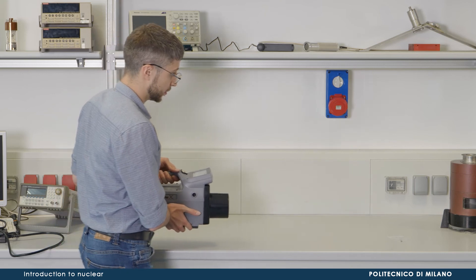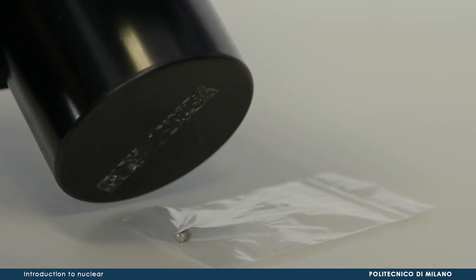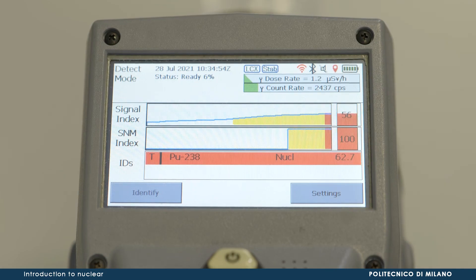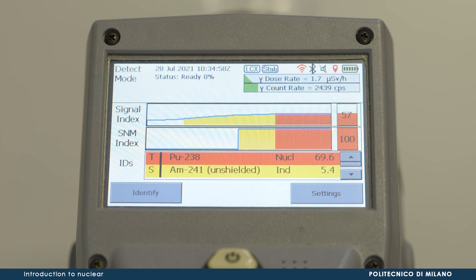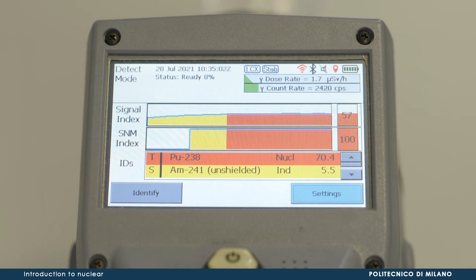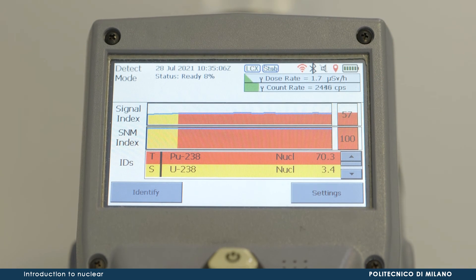By bringing the detector sufficiently close to a radioactive source, the count rate and estimation of the dose rate will be displayed on the detector screen, together with a listing of the radionuclide content of the source. The device can also be employed as an in-situ spectrometer, either stand-alone or plugged into a notebook.